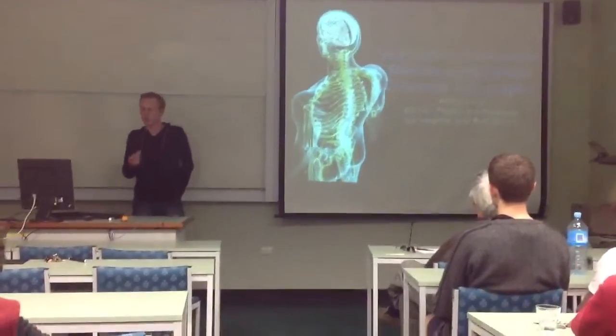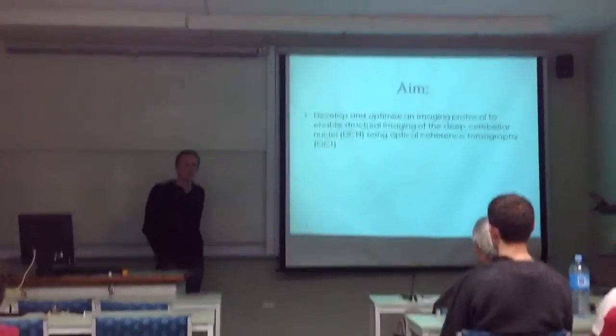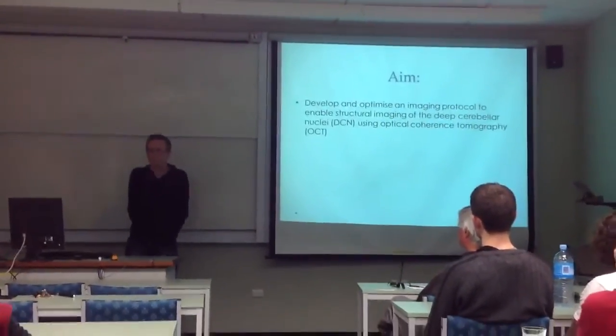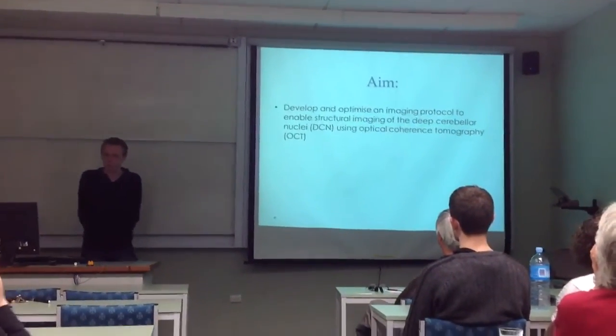We explore the cerebellum using optical coherence tomography. The aim of my project was to develop and optimize an imaging protocol to examine the structure of the deep cerebellar nuclei using optical coherence tomography.